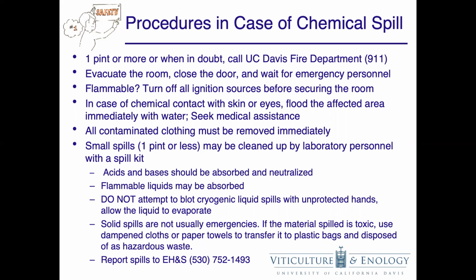Solid spills are not usually emergencies. If the spilled material is toxic, use dampened cloths or paper towels to transfer it to plastic bags to dispose of as hazardous waste. Please also report all spills to EH&S at 530-752-1493.